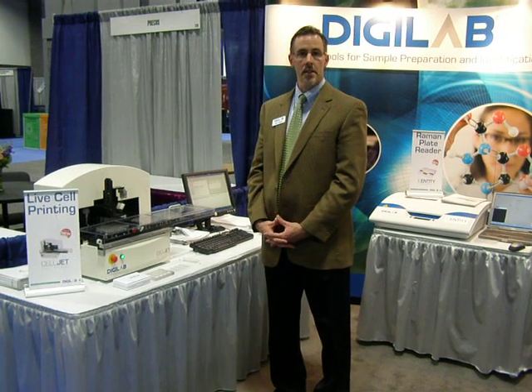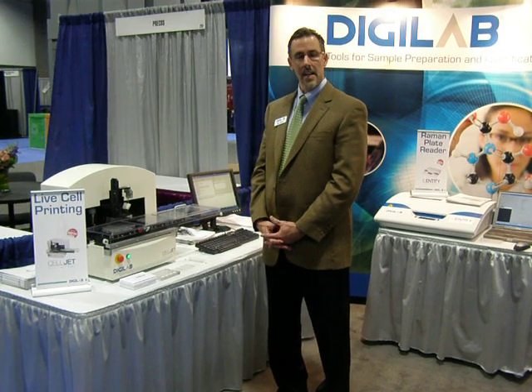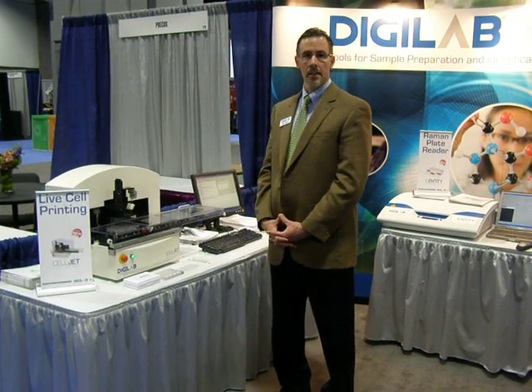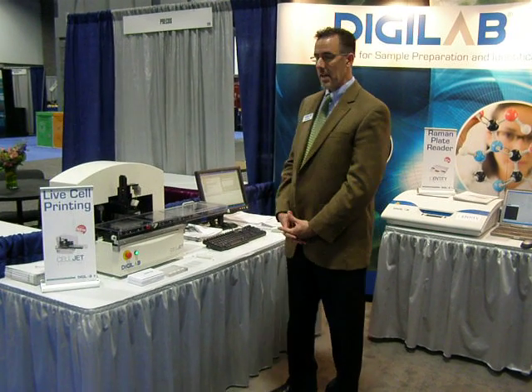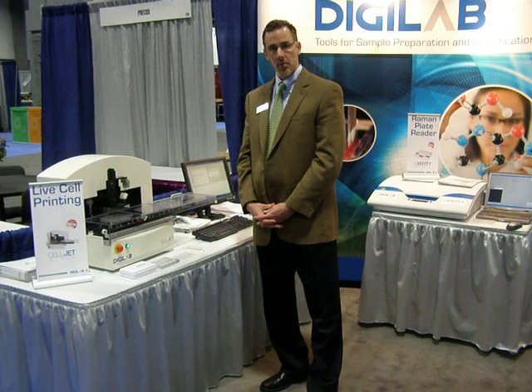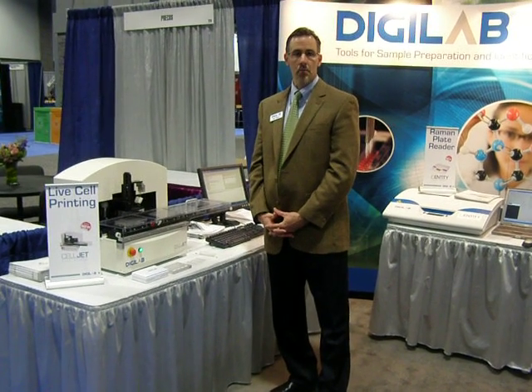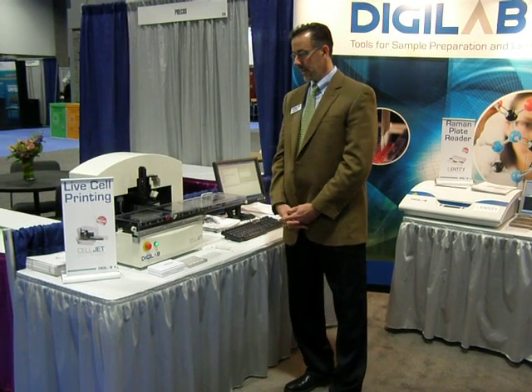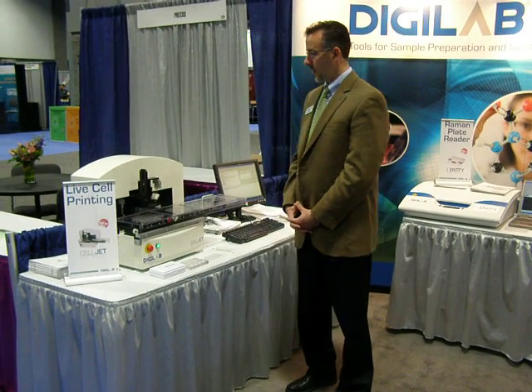proprietary SyncQuad technology, which allows us to dispense volumes from 10 nanoliters all the way up to 4 microliters in a non-contact manner. The CellJet is an adaptation of a technology that we've had for several years, but is tailored to cell printing applications and being able to keep live cells alive during very rapid dispensing sequences.